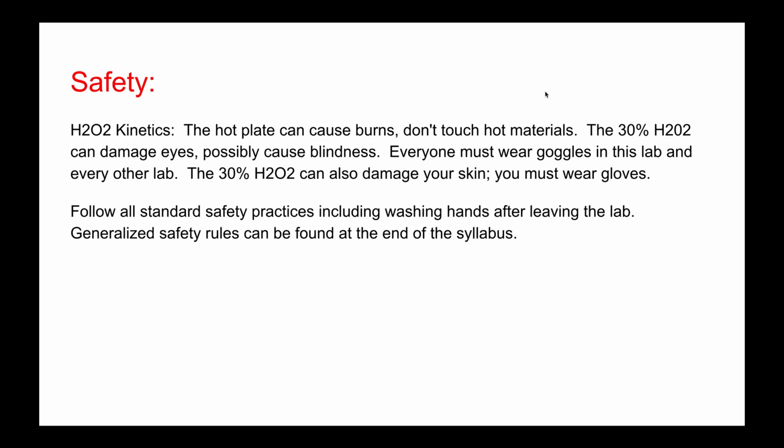Now, we're doing a remote lab this semester, but I just want to remind you of some safety. The hot plate will get very hot, at least the one we use in the lab, so don't touch it. The surface will burn you. It might have burned me at one point.